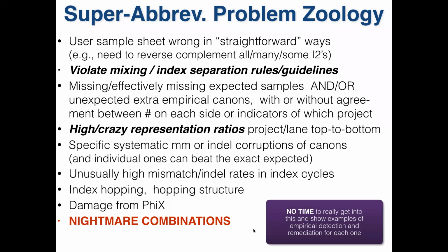So that exacerbates all the problems with the top. Right? So then you're asking for base colors going into a place where the complexity of the indices is compromised. If the bright guy, the 500 million guy, has a sequence close in indices to the low guys, it's the base call error right there. Because he's big, a little bit of bleed here, big contamination level. Yeah, there's lots and lots of trouble.